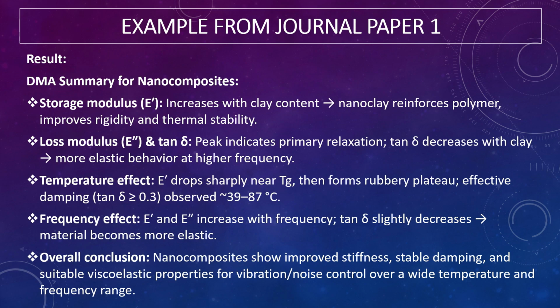Frequency effect: E' and E'' increase with frequency. Tangent delta slightly decreases. The material becomes more elastic. Overall conclusion: nanocomposites show improved stiffness, stable damping, and suitable viscoelastic properties for vibration or noise control over a wide temperature and frequency range.